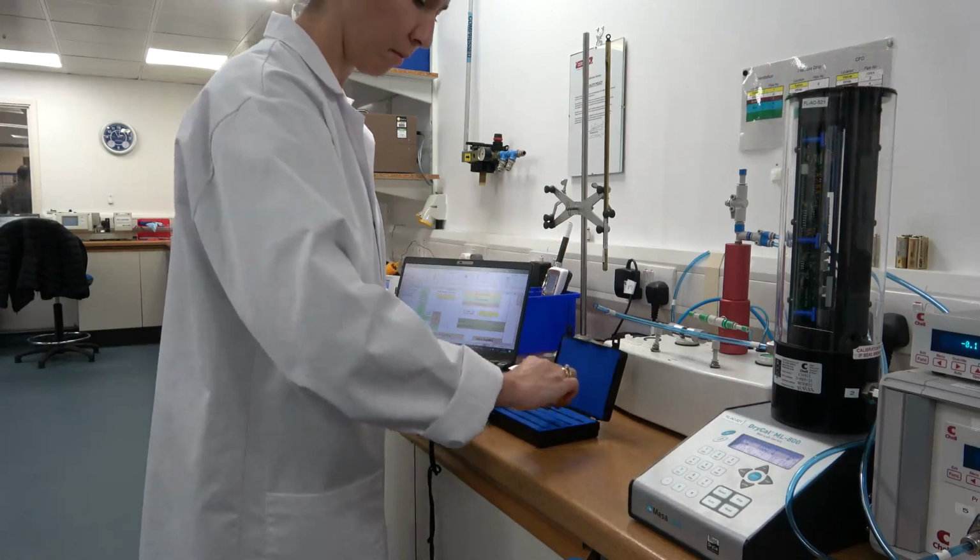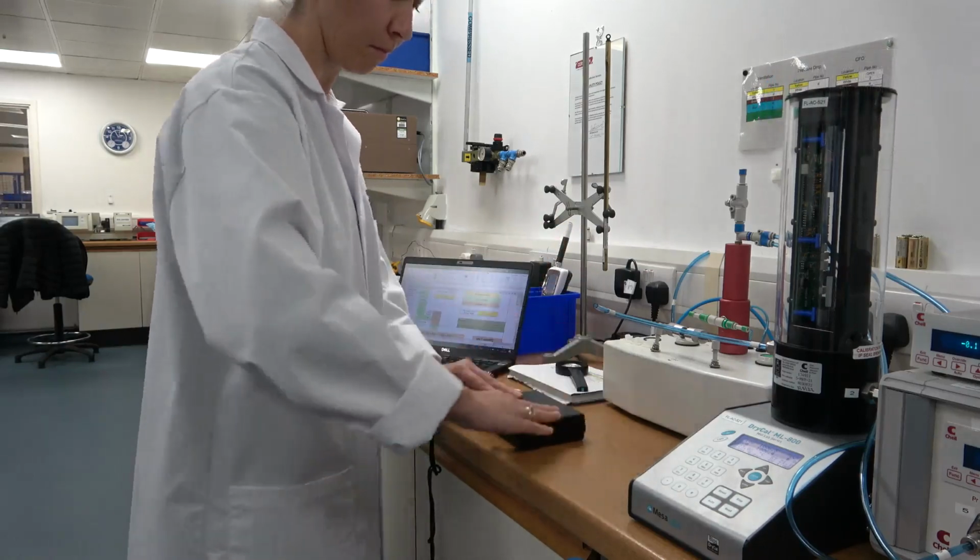In terms of storage, it is recommended to keep the standards in a safe place, ideally in a box with foam inside, to prevent any chipping of the glass and any dust accumulation.